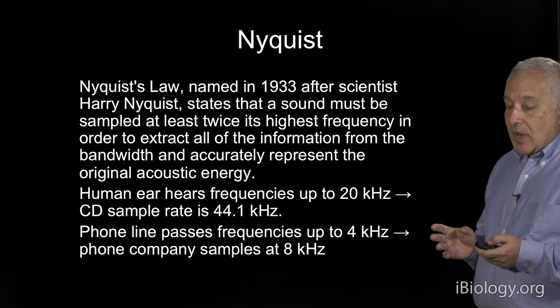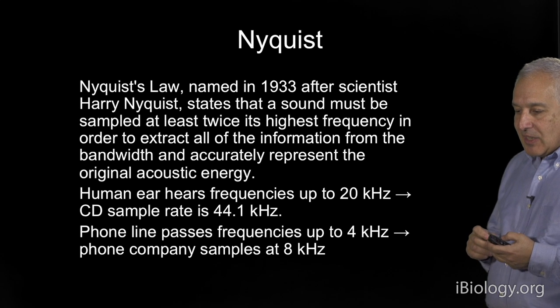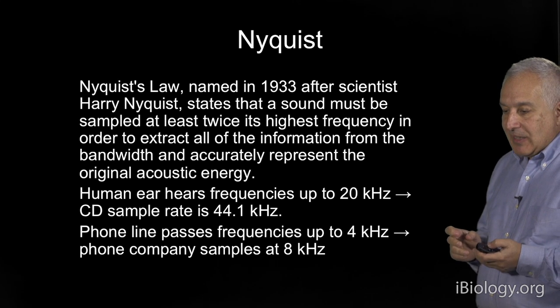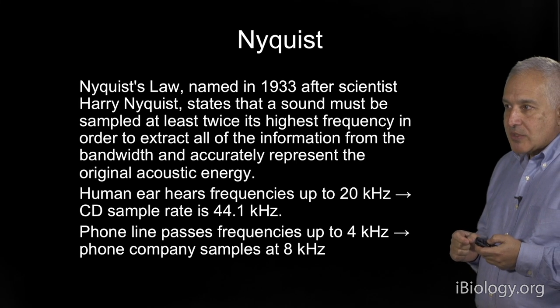I want to just say one last thing, which is important to realize: if you want to get the resolution out of your light microscope, you not only have to understand what limits it in terms of the diffraction limit, but you have to sample the image at enough frequency that you can see those high frequency details. And this requires you to keep in mind Nyquist's limit.